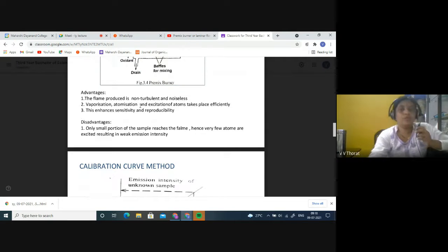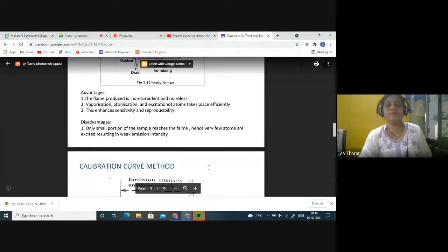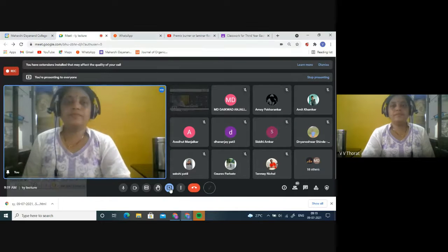Now I want to show you all what is noise. Let me stop and show you on the board. Noise means unwanted variations or unwanted peaks.